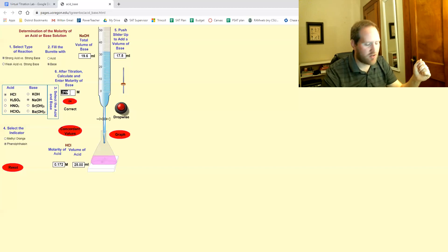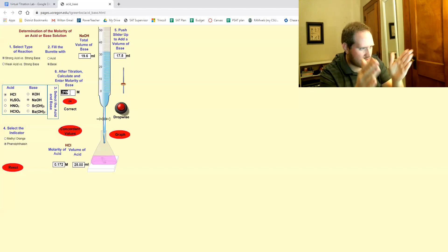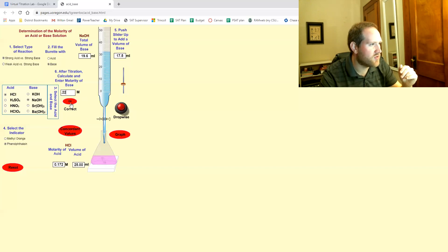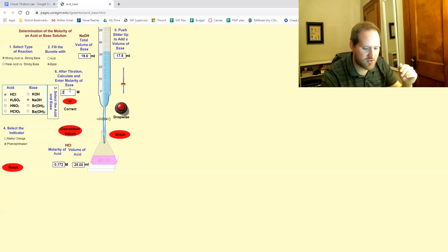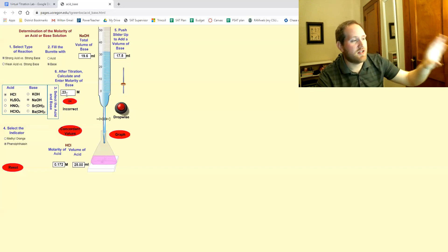Yeah. I'm curious what the window it gives you of success. Let me try 0.22. That's correct. 0.23. Anyway, so you do this until you get it correct.